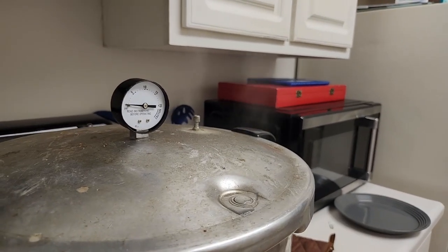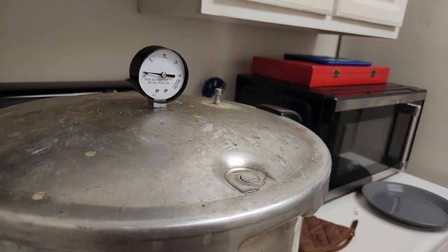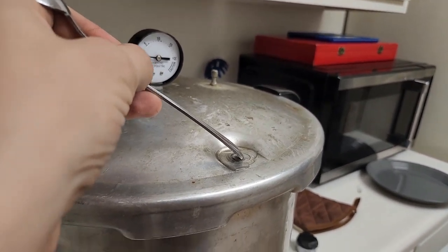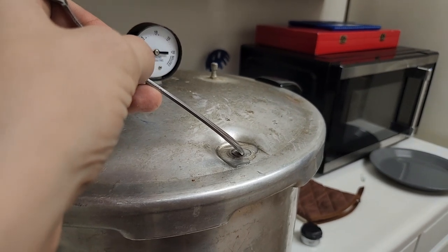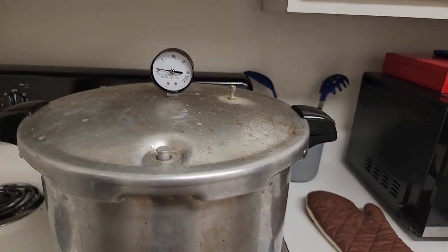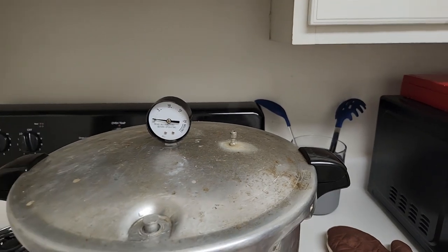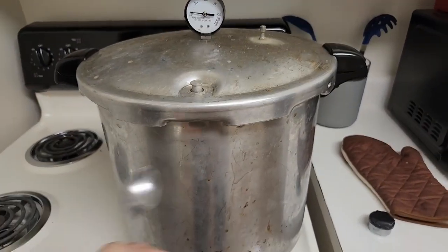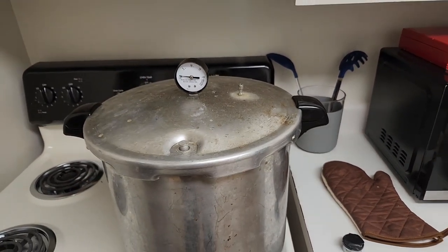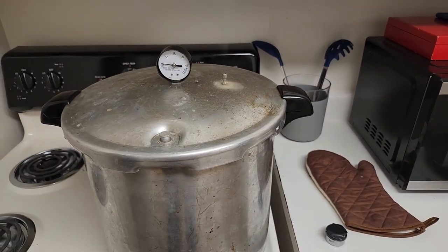Once you have steam coming out like this, it's not quite purging. The lock has to be up. You can encourage that to happen just by holding it down with something for a couple seconds, you know, 5 or 10 seconds, and once the pressure builds up, you just release it and it pops right up. And now it's purging. You can see that it's got steam coming out, and it's getting rid of all the trapped air inside of there to make sure the entire thing is filled with steam, which will help it get to sterilization temperatures properly. So I'm just going to go ahead and let this purge out for about 15 minutes.